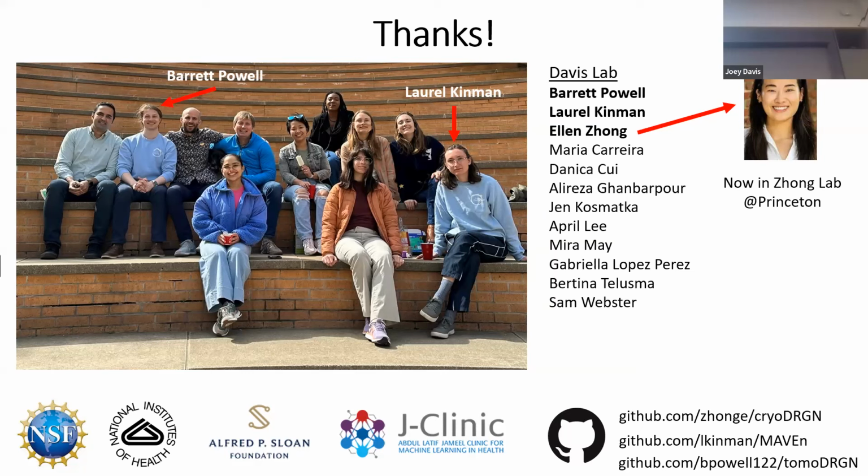And then try our algorithms or anyone else's, and basically just ask, who gets the distributions right? And when they're wrong, which types of particles are they failing on? And are there certain pathologies associated with those particles that cause them to fail? Is it always from this viewing angle, you can't figure it out? Or is it that this particle is exposed to too much dose?